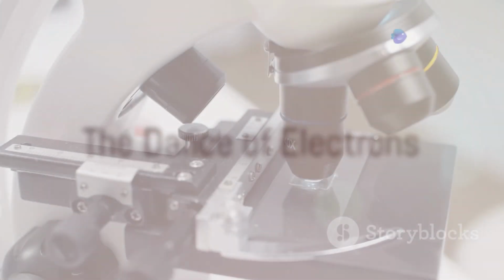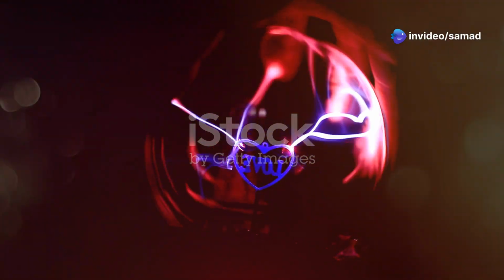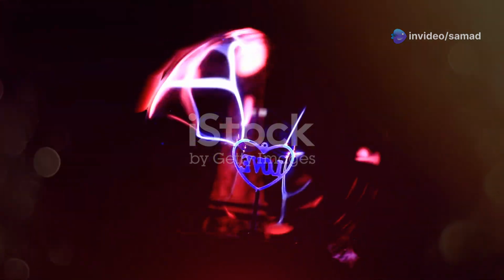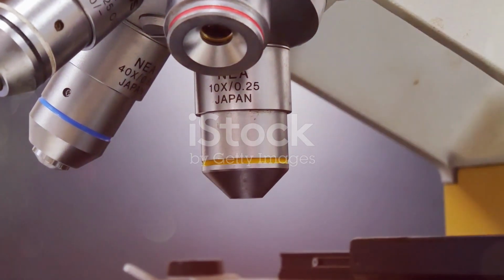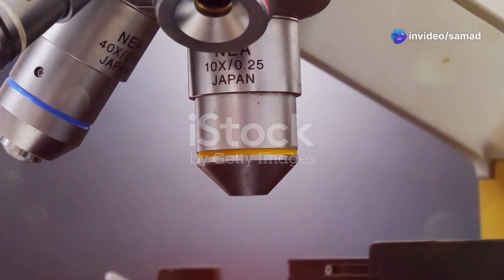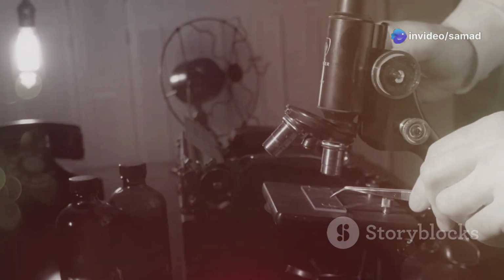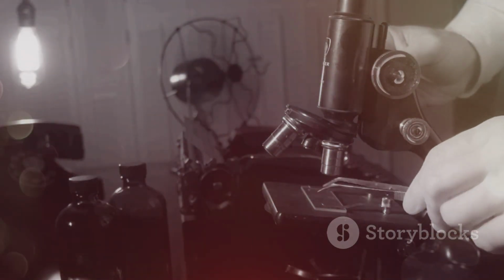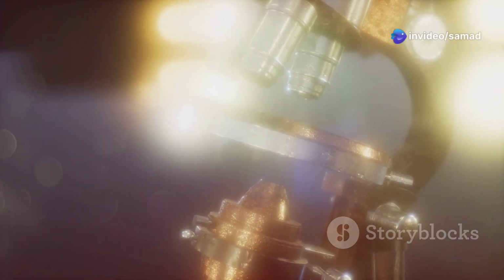The heart of an electron microscope lies in its ability to manipulate and focus a beam of electrons. This beam, generated by an electron gun, is accelerated by a high voltage and then passed through a series of electromagnetic lenses. These lenses, analogous to the glass lenses in a light microscope, act as focusing elements, but instead of bending light, they control the path of electrons using magnetic fields. By carefully adjusting the strength and shape of these fields, scientists can focus the electron beam onto a tiny spot on the specimen.